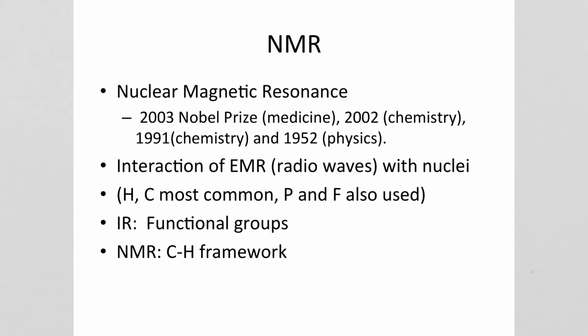So NMR is a pretty important technique. NMR stands for nuclear magnetic resonance. One way that you can tell it's a really important technique is that it's won 4 Nobel Prizes, and I'll talk a little bit more about that in a second. As I've said in class, it's based on the interaction of electromagnetic radiation, specifically radio waves, with nuclei of atoms.